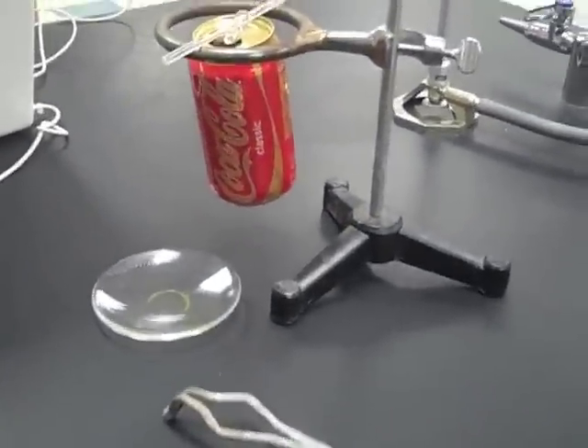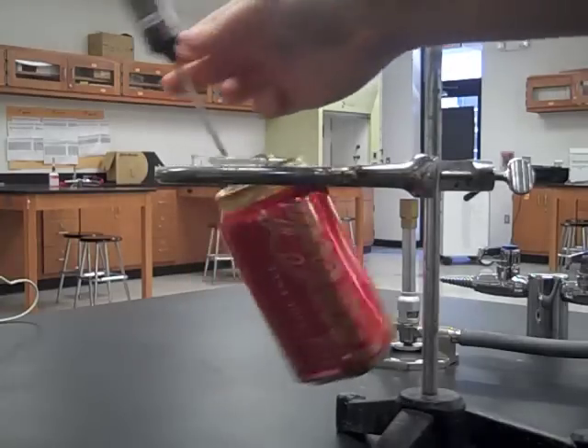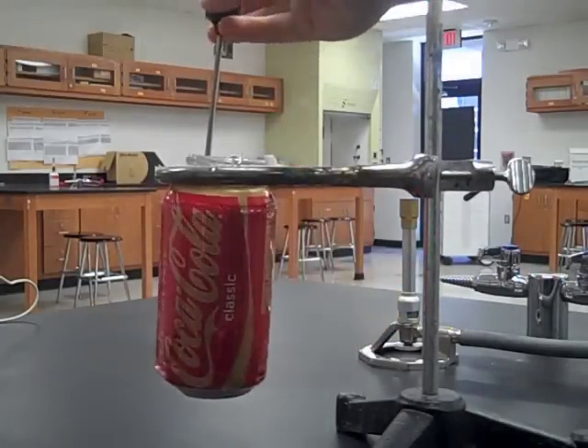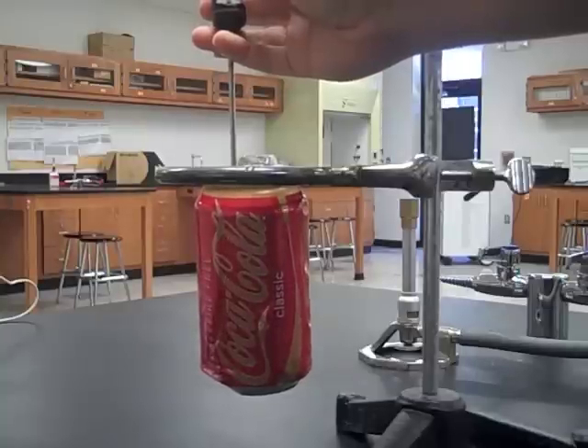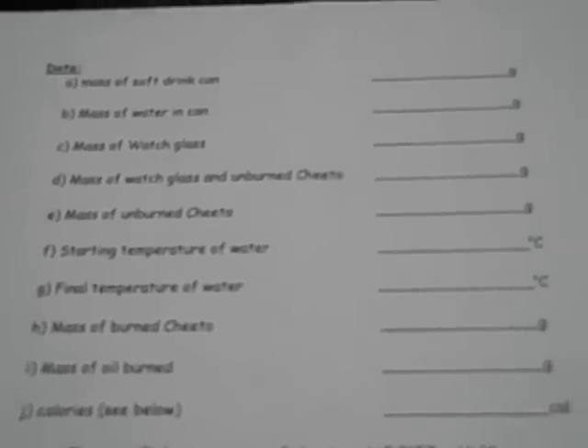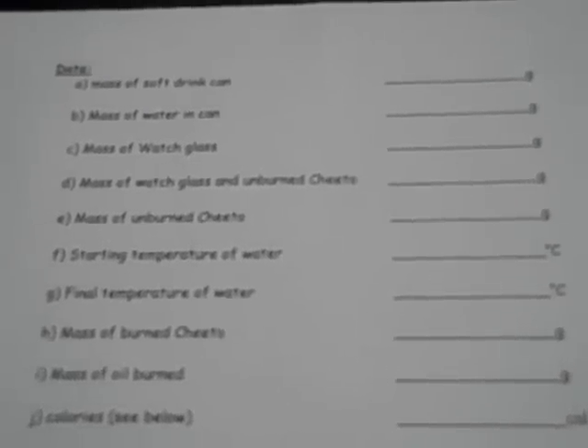When you're measuring the temperature of the water, notice that the thermometer moves the can too much since it's so heavy — you just need to hold the thermometer with your hand.